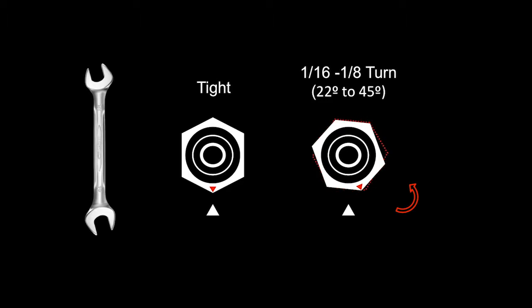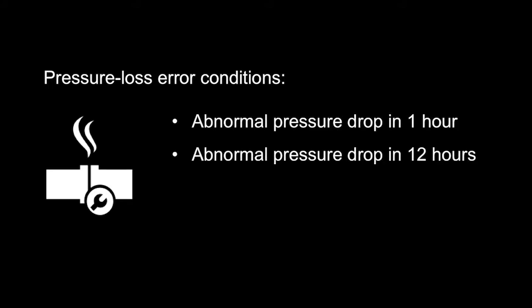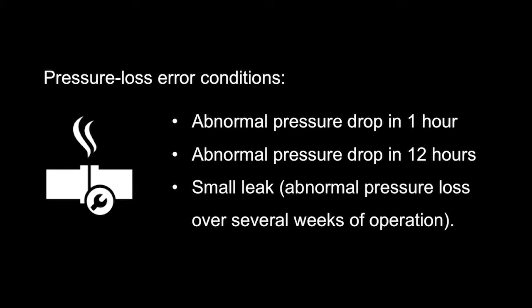If the leak persists, please contact Morgan Schaefer. Small leaks of calibration gas may be detected by watching for any of the following pressure loss error conditions that are based on readings from the calibration gas pressure sensor: Abnormal pressure drop in one hour, abnormal pressure drop in 12 hours, small leak, abnormal pressure loss over several weeks of operation.